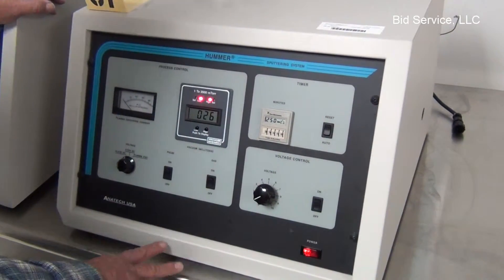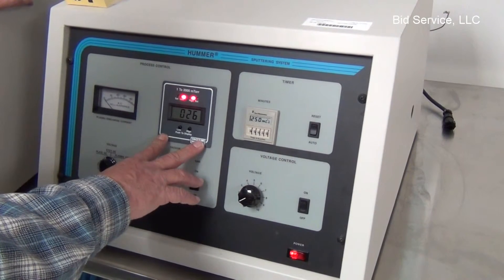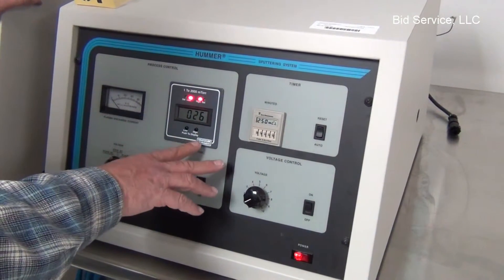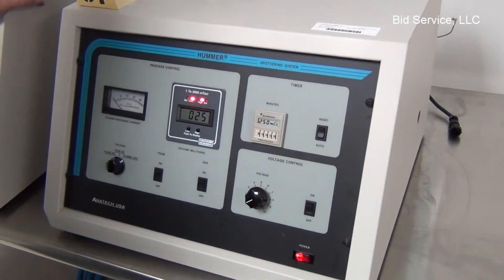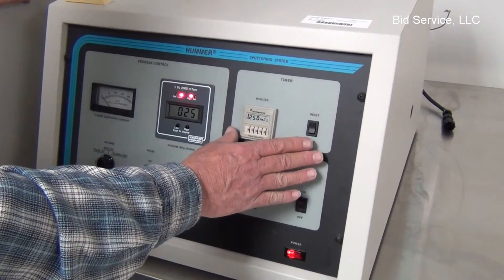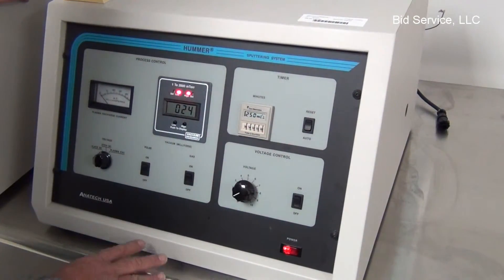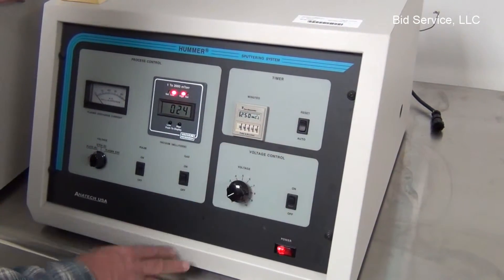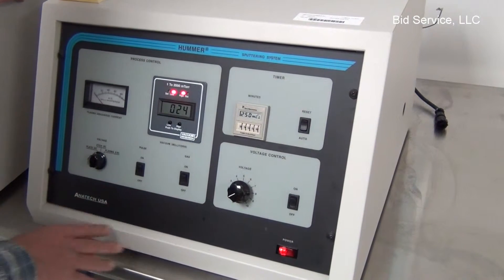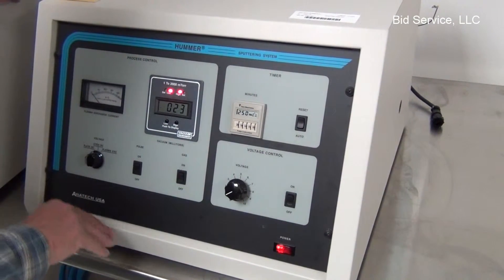Okay, now we're looking at the Hummer 6.2. We've evacuated the chamber and we're below 30 milliTorr. The voltage control is here, the timer — which also works as the start — is here, the gas control is here, and the different modes of operation are here. I'm going to show it in the plating mode.